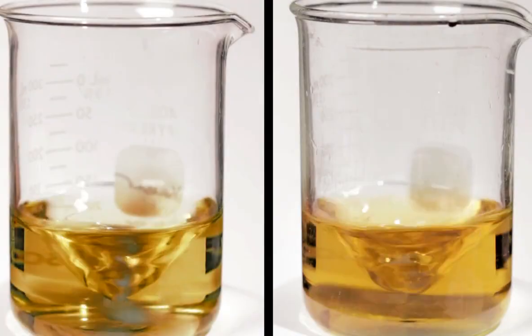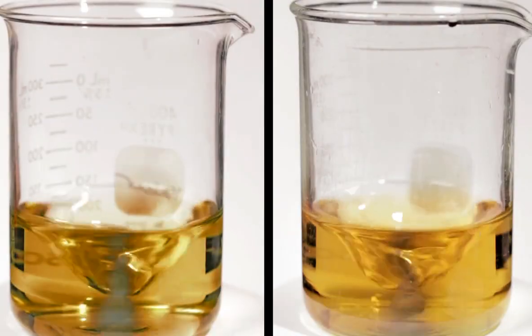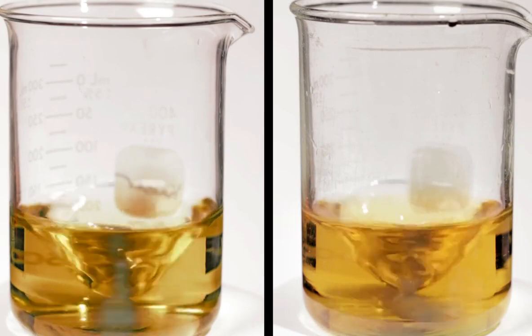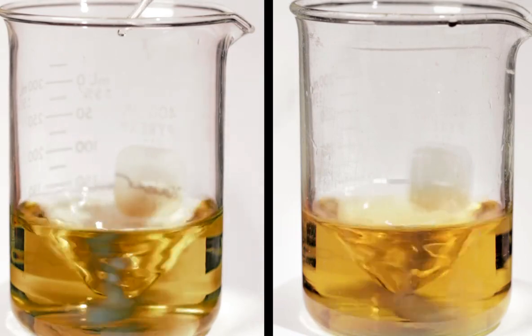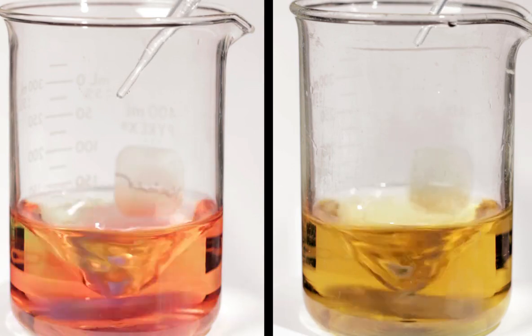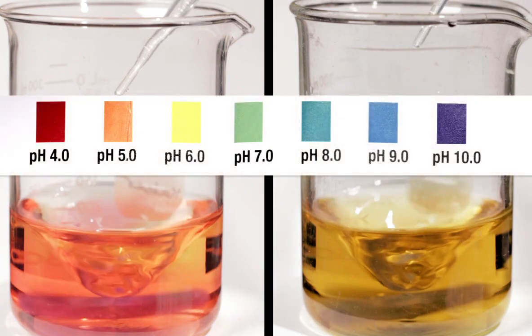Let's reset. Here are the same two starting solutions, A and B, with the same indicator. But this time, I'm going to add concentrated hydrochloric acid, a strong acid, to each solution. It only took one drop of strong acid to dramatically lower the pH of solution A. But the pH of the other solution hasn't changed.